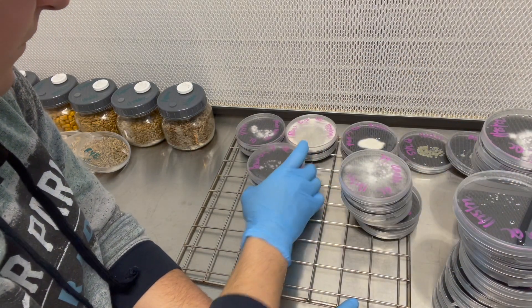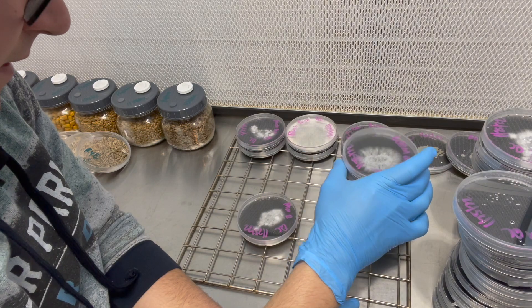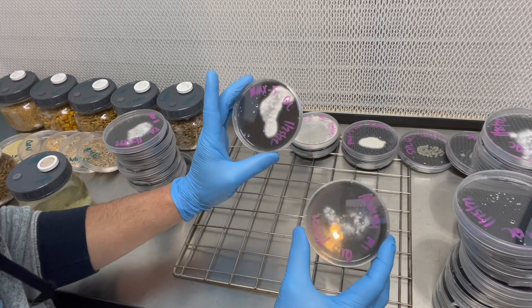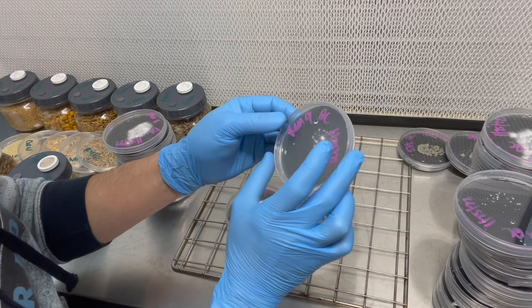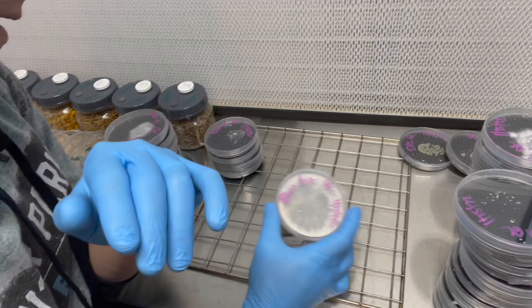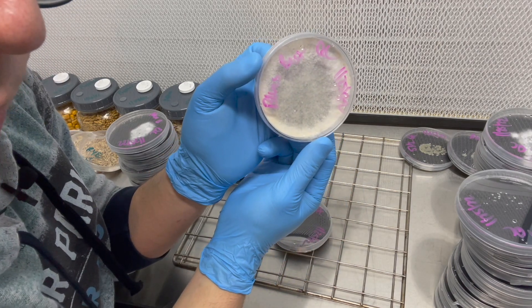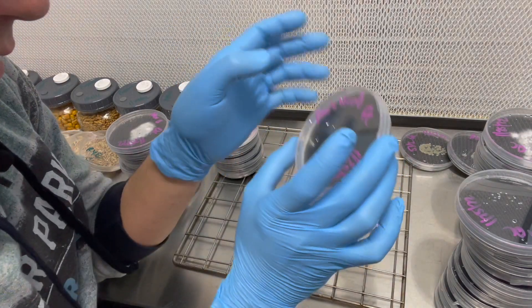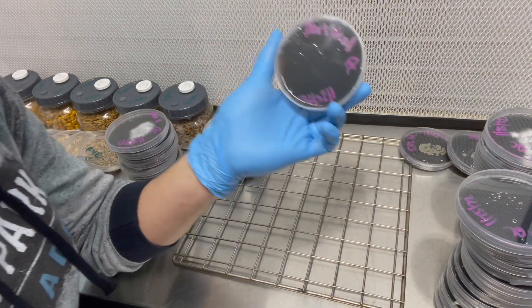Turkey tail, brown oyster, golden oyster, Namiko. This is a cordyceps — two different cordyceps cultures. Namiko number nine is a little bit slower on this one. And then you can see we've got a Morchella importuna — a very fast culture, this one was almost colonized in two or three days. Compared to our bear's head, which you can see just has some colonies starting out after five days — a very slow grower.